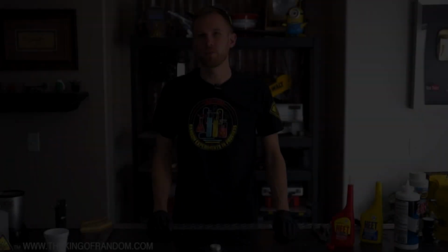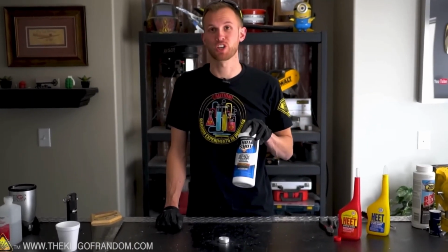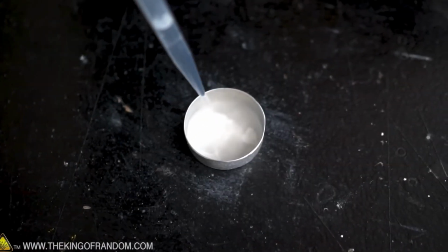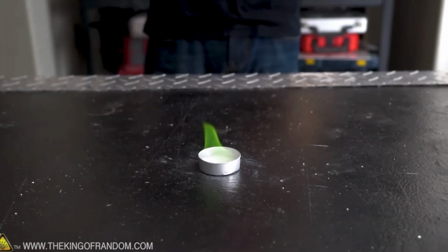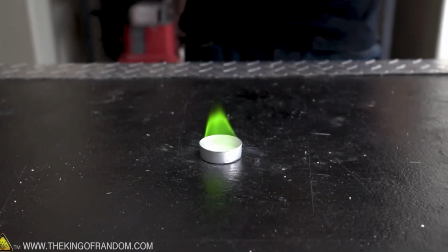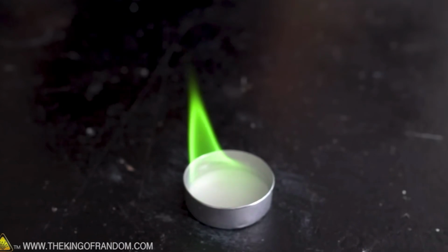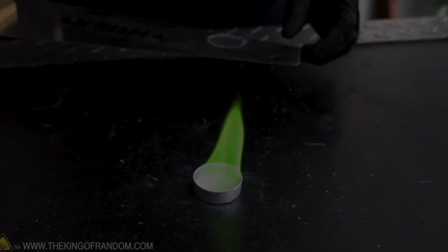Moving on to green, every resource I could find recommended the same thing, boric acid, which is usually found as an ant and roach killing powder. Let's just try putting that in, adding some ethanol, and see what color it burns. Ooh, that is immediately green. Like no warm-up time with a blue flame or an orange flame. That went straight to green. No wonder everyone recommends this stuff. It's pretty conclusive. That's green. It looks like something straight out of Harry Potter.